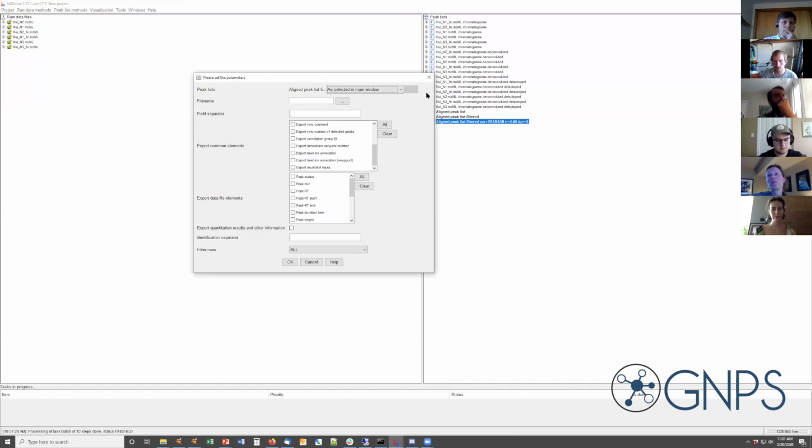Like you select all your data and you plot the TIC, and then you just export that. Exactly. So normally what we do is I want the ID, that would be the scan number, then the m/z value, retention time, and then I typically take just the peak area. But in addition to that, I could also export others like the peak height or the peak duration. Then I would just get new columns, which would tell me that those peaks had that width, which may be important for you to evaluate your chromatography performance.